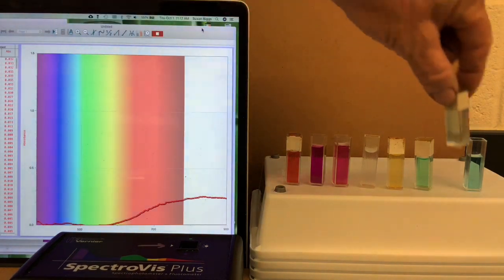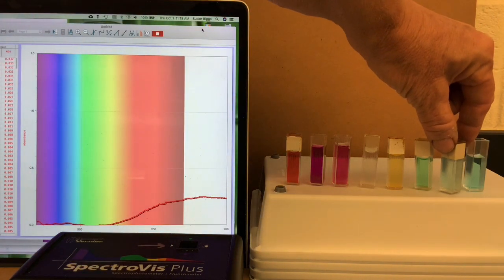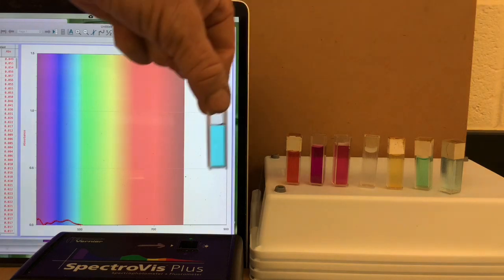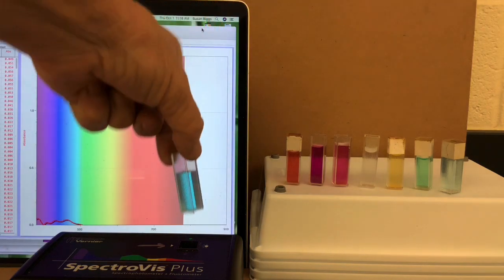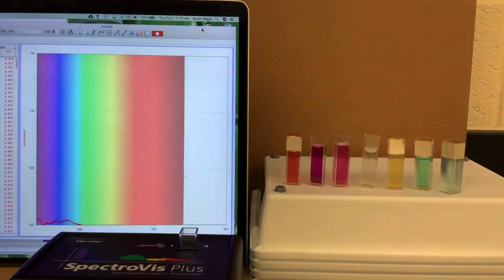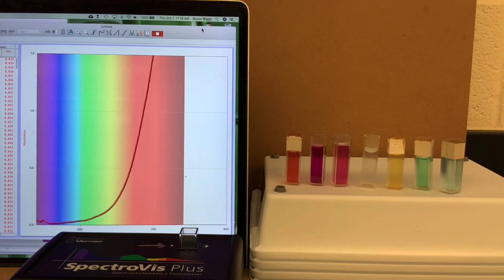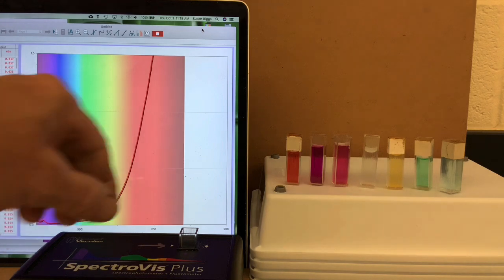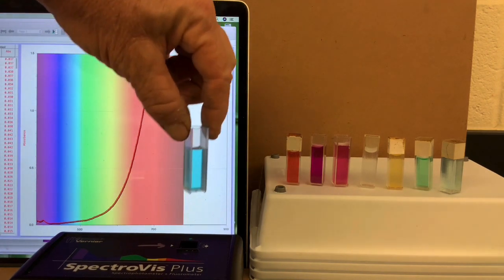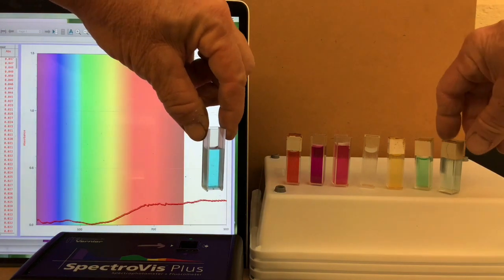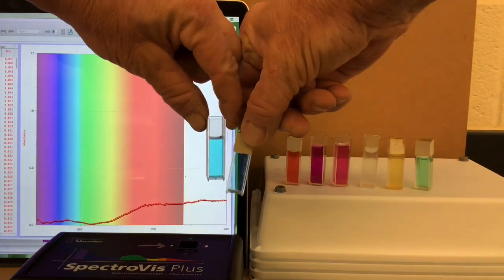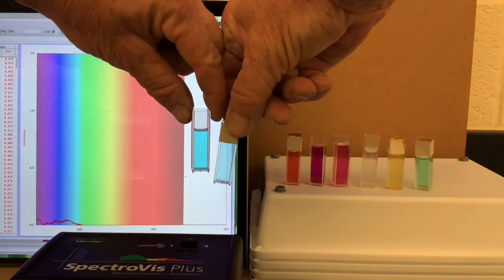And now, we'll take a look at the second copper, which is a bit more concentrated, as you can see by the intensity of the color. And whoa, we're off the scale, but also still absorbing in the red region for this blue solution.